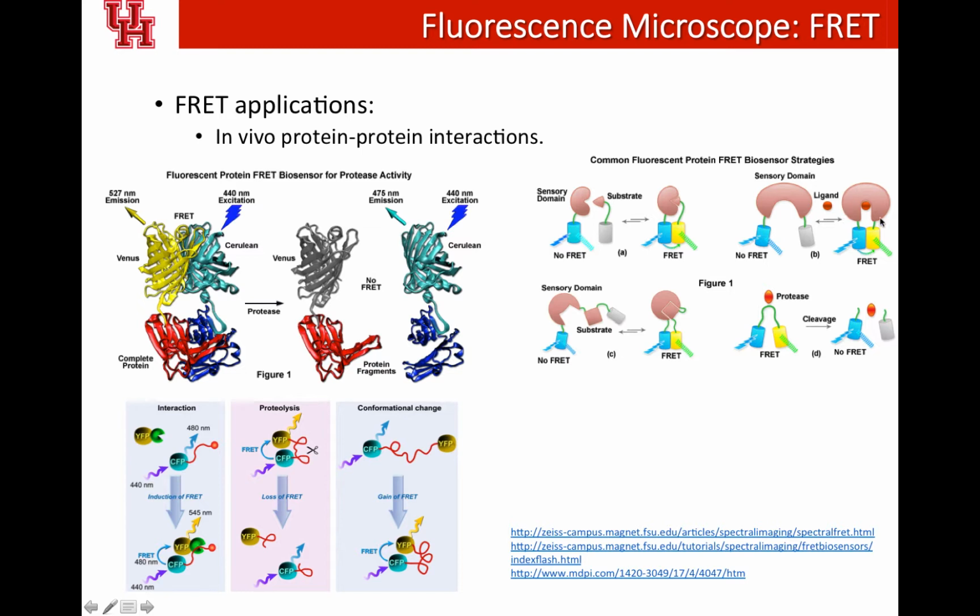So when you bind, they change the conformation of this protein, and then they push these two fluorophore molecules really close to generate a FRET. And there are other examples, like after binding they change the shape, and you get these two fluorophores really close. And then the last one is also the proteins. Initially you have a FRET, and then when these proteins digest your maybe peptide, these two molecules will leave each other, and you will have no FRET.